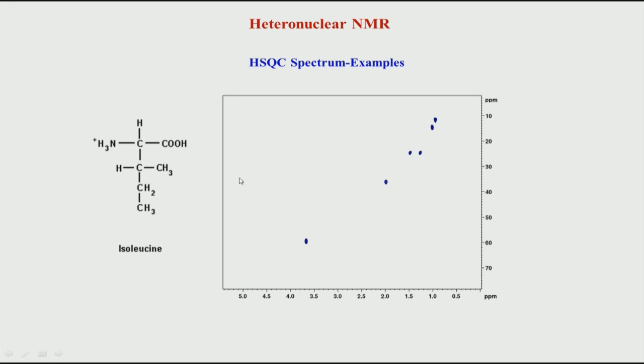So, now let us start by looking at which peak can correspond to which of these CH. So, how many CH pairs do we have? We have one here, that is CH3, and remember, the H3 are always equivalent. Then we have CH2 here, these two are not equivalent, but for the time being we will consider them as the same chemical shift. So, we have one CH here, that is one, this is second, this is a third, a fourth and a fifth CH pair.